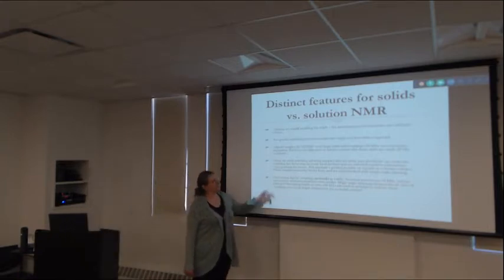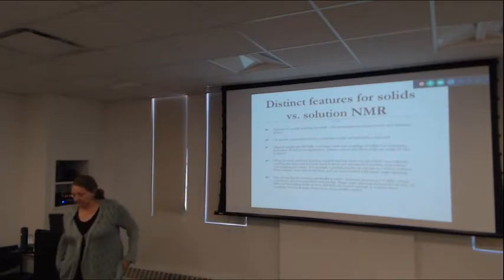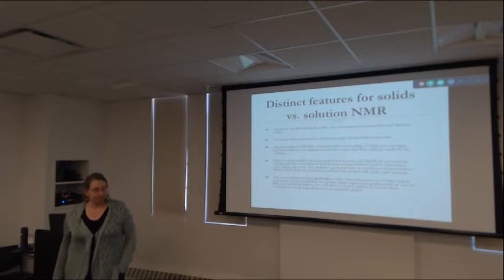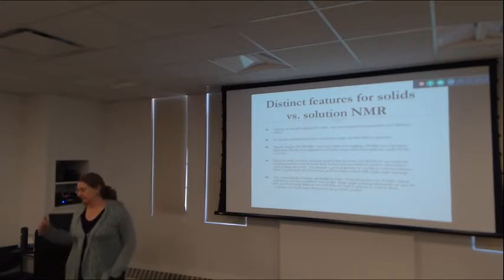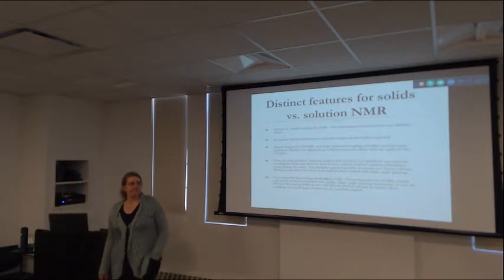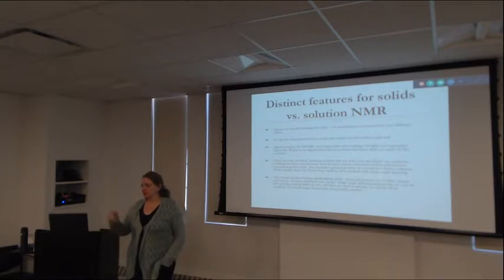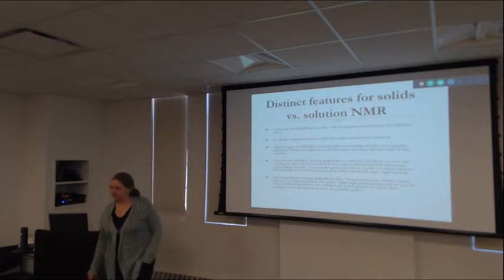Now, a lot of the time we study what we call powders, and here again we have a kind of specialized use of that word powders. What it means is that the sample is static, it's not dissolved, it's not tumbling, or solid, the way we defined solid before. But it's not oriented at all. It's like completely random. So maybe an example would be a crushed crystal, very small crushed crystal, and shake it well and make sure that every crystal is randomly oriented.